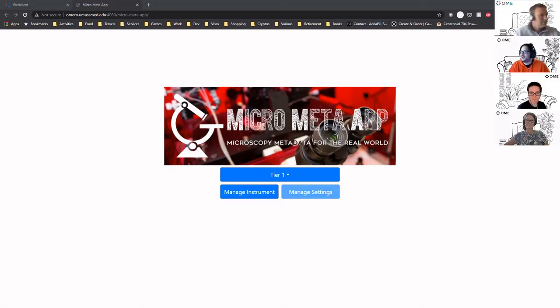Is there anyone? Oh, yeah, Jean-Marie again. I've got another question. This is more practical and technical, because I was checking its Electron app. So what you showed today, do you envision, if you choose Electron, to have a web app as well, or an extension?